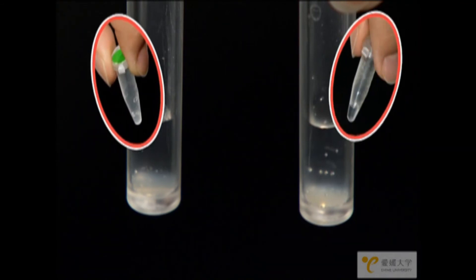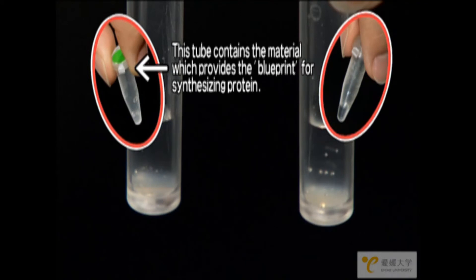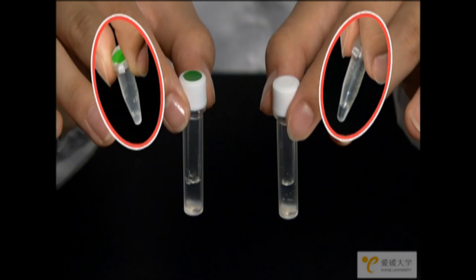There are two small tubes but one of them had the material that contains the blueprint for synthesizing the fluorescent protein. That was added to the tube with the green dot. It was not added to the other tube so the protein will not be synthesized.